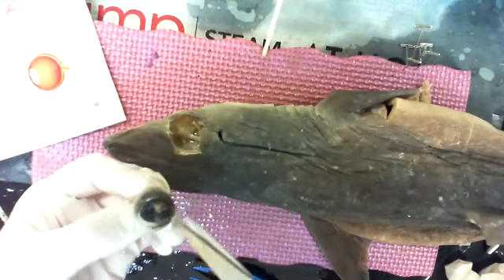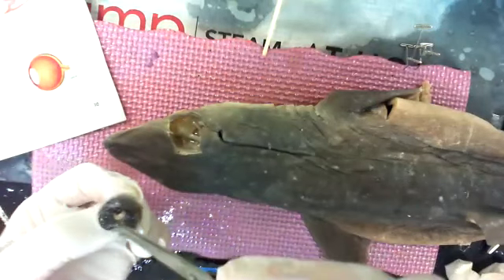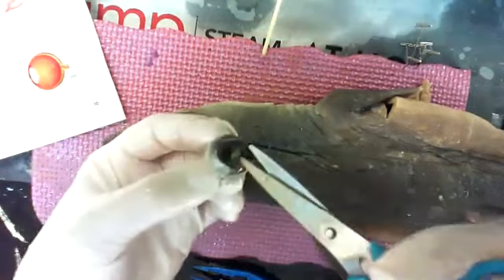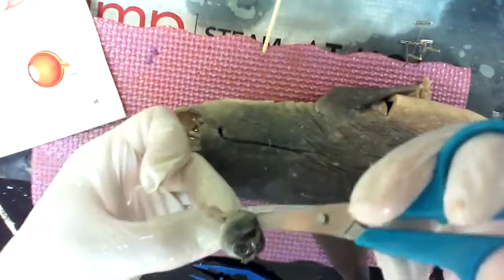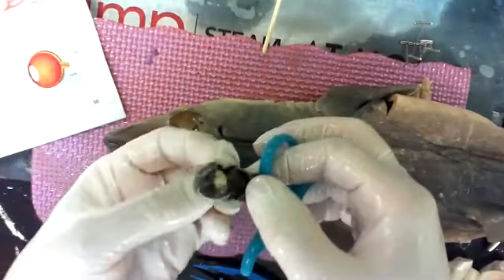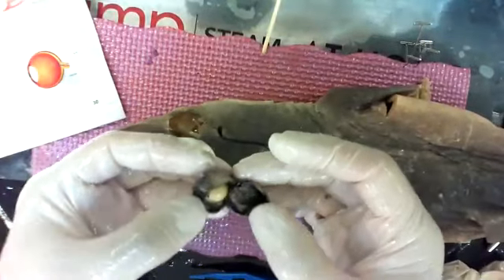I'm cutting across. I cut through the cornea, the clear layer across the top. I can open it up, a lot of fluid leaking out. I'm just gonna cut it. We call this clamshelling, so that when you cut something round on both sides, you can actually open it like a clamshell, like this. So I'm opening it up. Stayed pretty intact. Here we go.